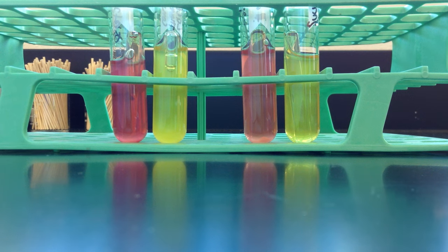This video outlines fermentation of simple sugars, testing this with the Durham tube or what's often called the carbohydrate tube. This is a broth medium.